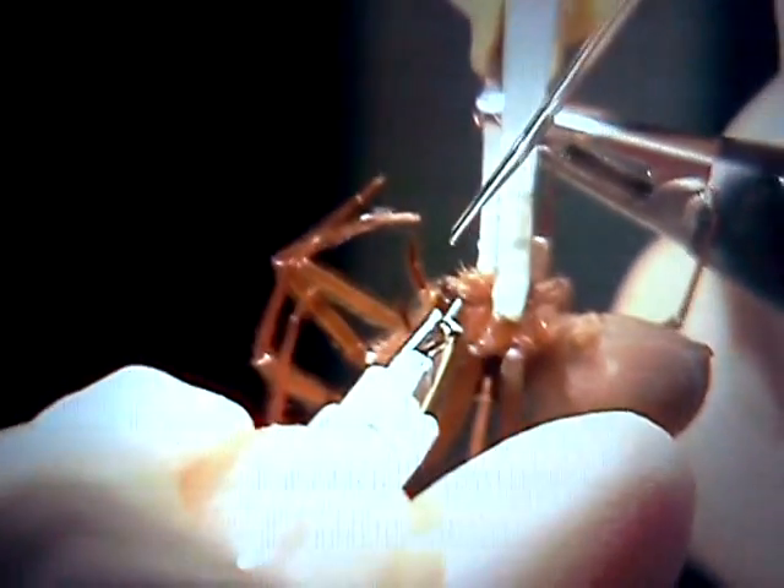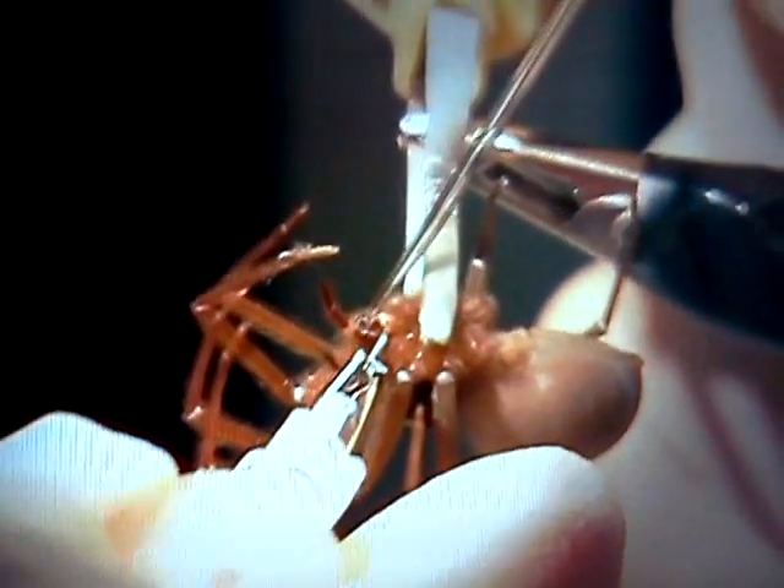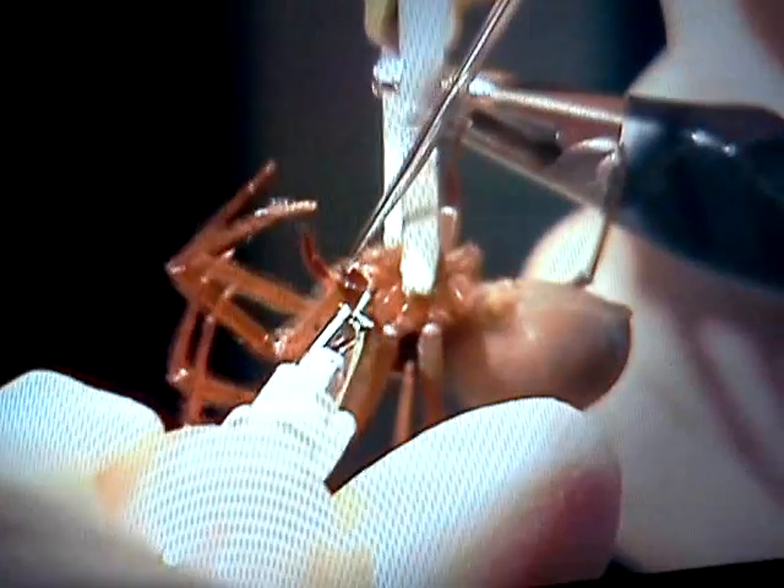This is a special made venom vacuum in my left hand. I'll capture the venom in this glass capillary, and I've got the venom vacuum on the spider's mouth, and I'm stepping on the foot pedal now.